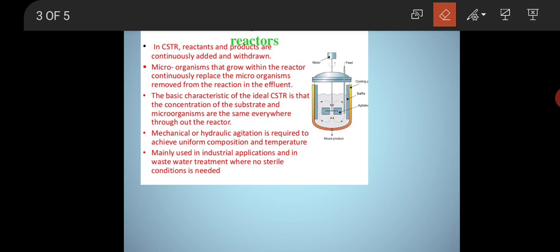This type of sparger is used in the small fermenter tank, or we can say small stirred fermenter, and it consists of a pipe-like structure kept below the impeller in the form of crosses. So that is the orifice sparger. Just keep in mind the function of the sparger: it is used to break the incoming air into small bubbles. So that is the oxygen delivery system.